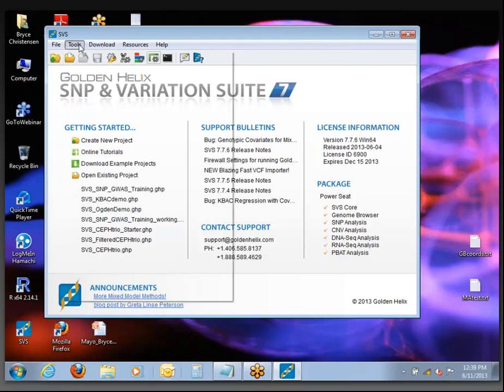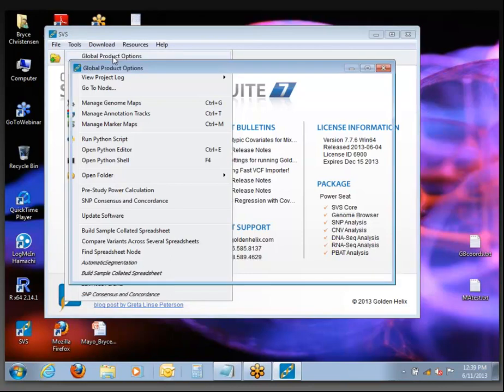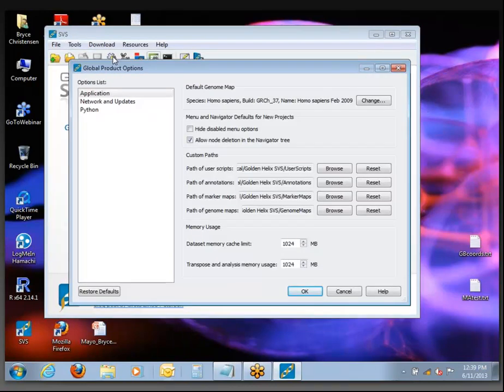In the Tools menu, the section called Global Product Options is kind of important.